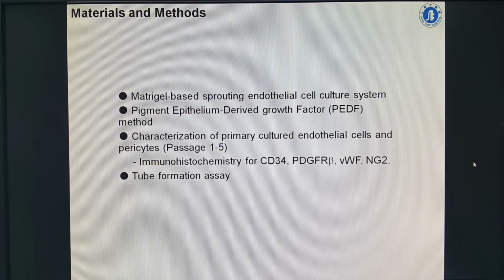To establish an in vitro model to mimic the diabetic ED, the primary cultured cells were exposed to normal glucose and high glucose conditions. We also performed the tube formation assay to evaluate the ability of the corpus EC and PC.